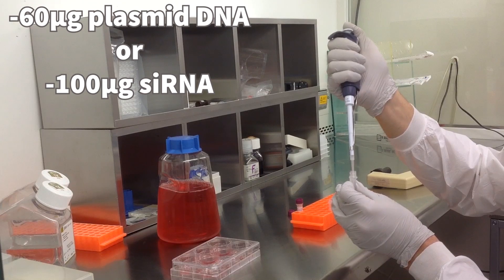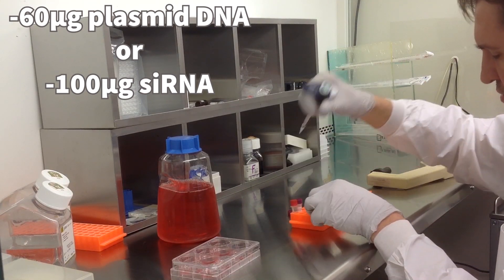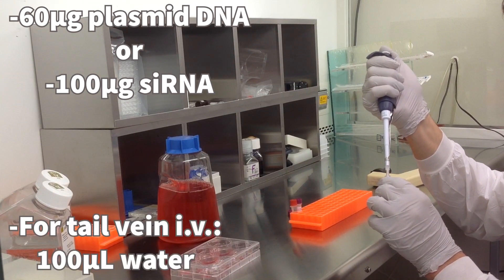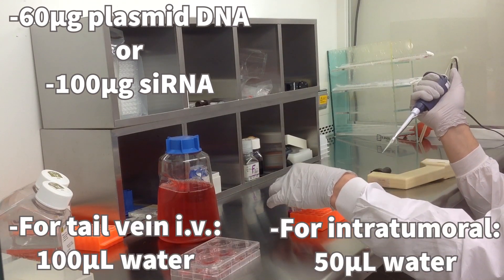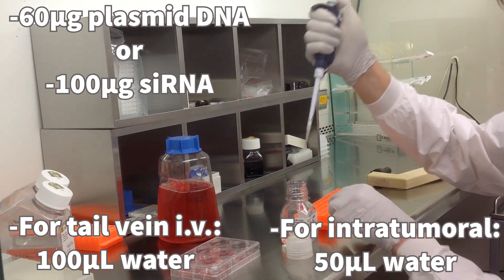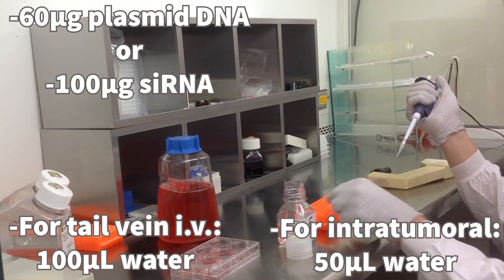Start by diluting 60 micrograms of plasmid DNA or 100 micrograms of siRNA into either 100 microliters of water for tail vein IV, or 50 microliters of water for intratumoral IT administration. All water used is DNA and RNase-free, molecular biology grade water.